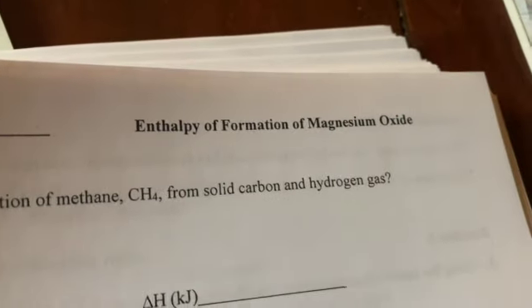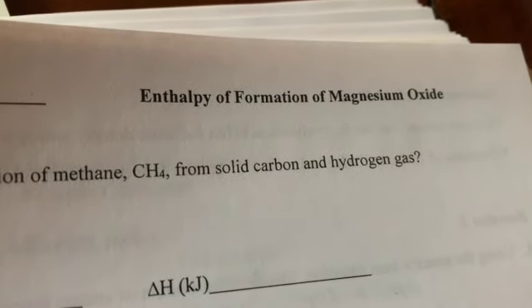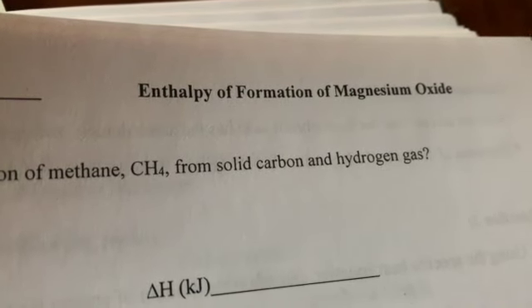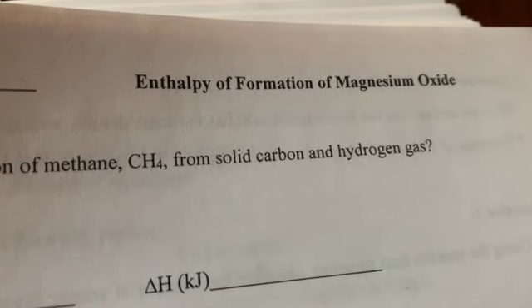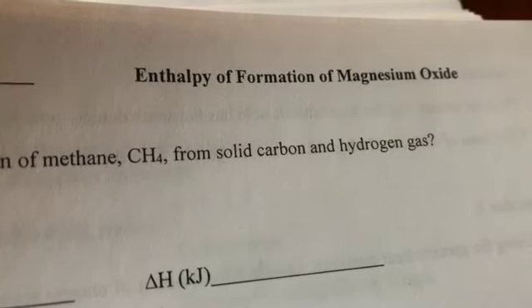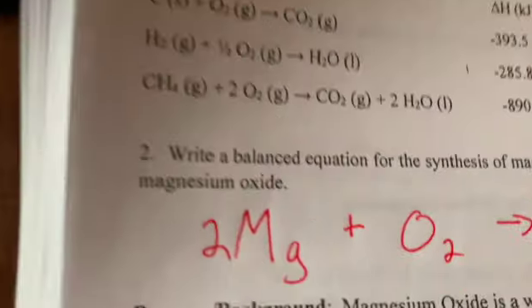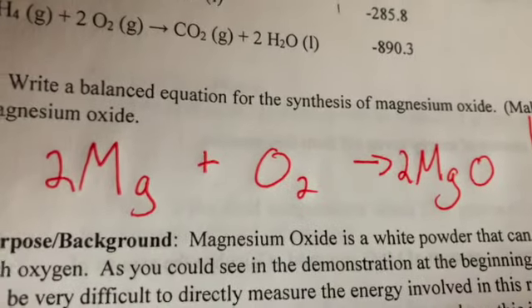Hi everybody, and welcome to our enthalpy of formation of magnesium oxide lab. In this lab, we are going to be using Hess's law to help us determine what the enthalpy, or heat, of formation of magnesium oxide is. All right, so the reaction that we are interested in, this is the balanced equation for it.